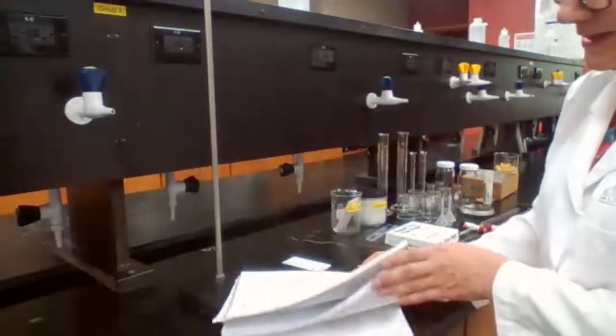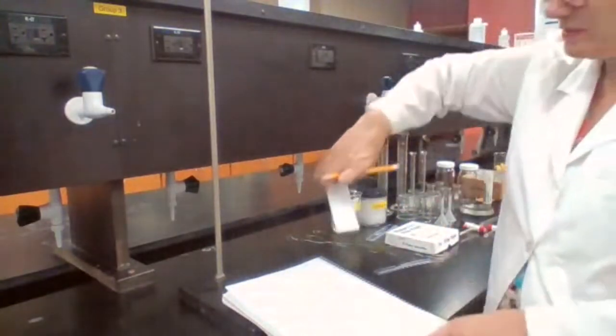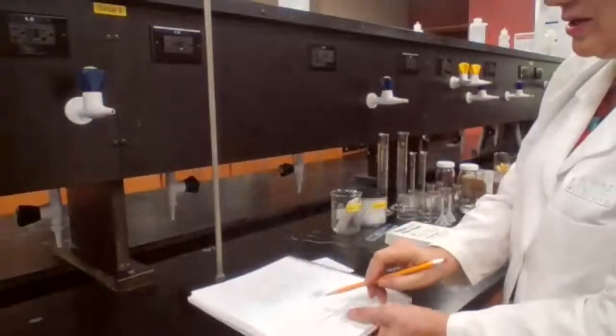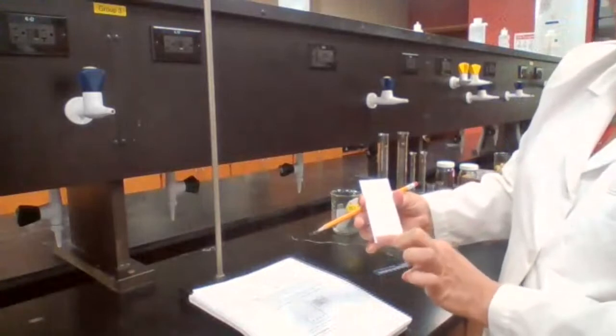Based on the procedure that I'm performing, I'm going to write, because I don't have space here to write what goes in each of the spots, but I have to have a sketch of it so I know what goes on spots 1, 2, and 4. So later on, I don't lose track of which one was the first spot from left to right. I have to have a label for it.